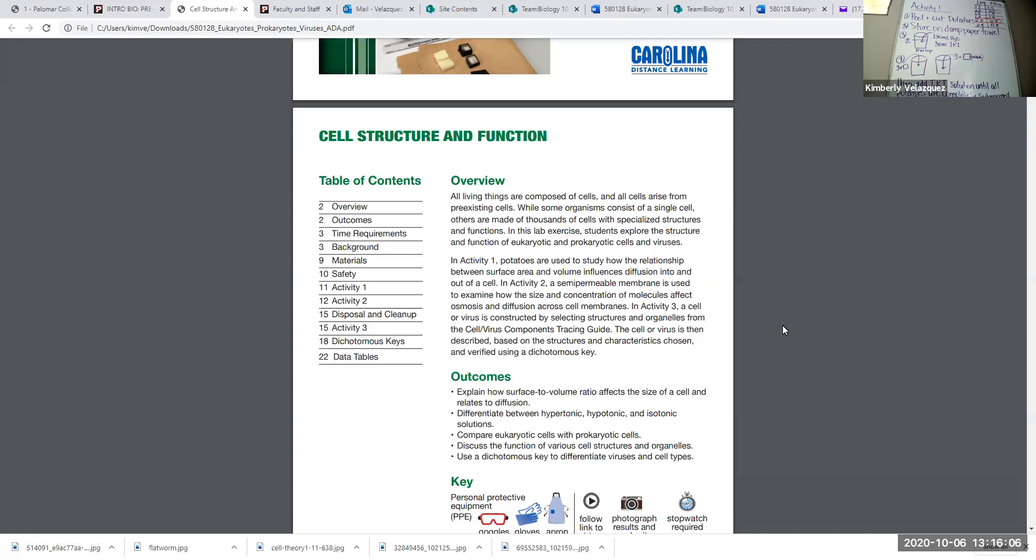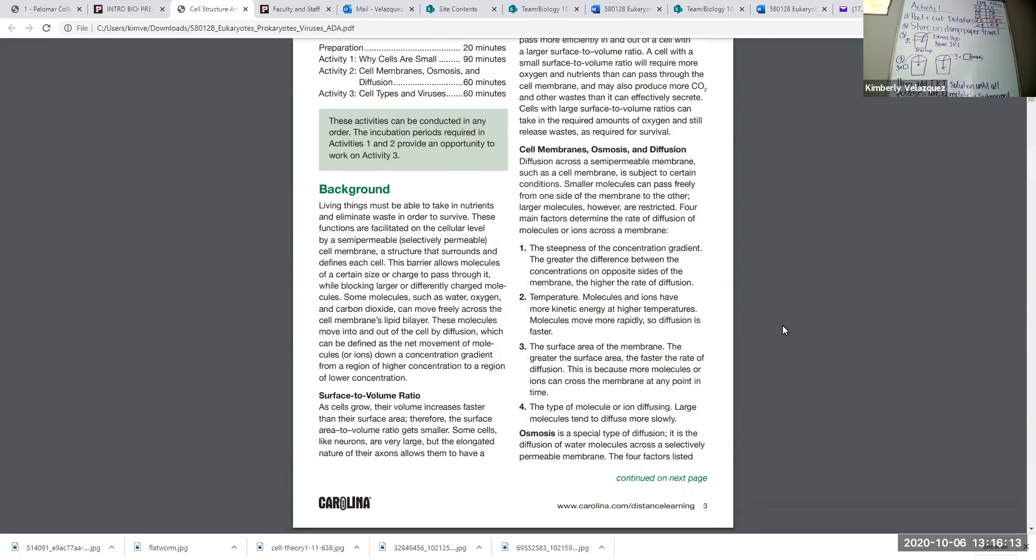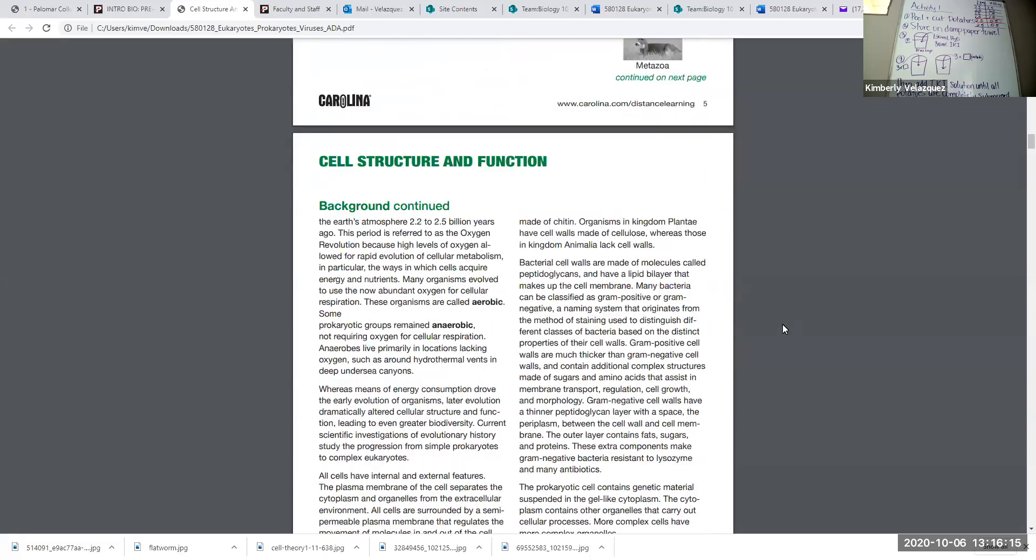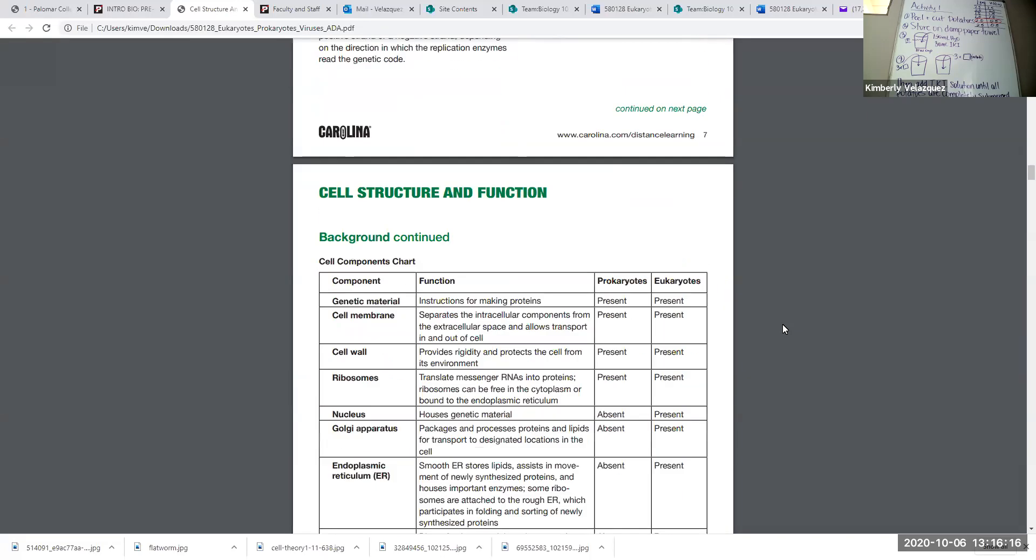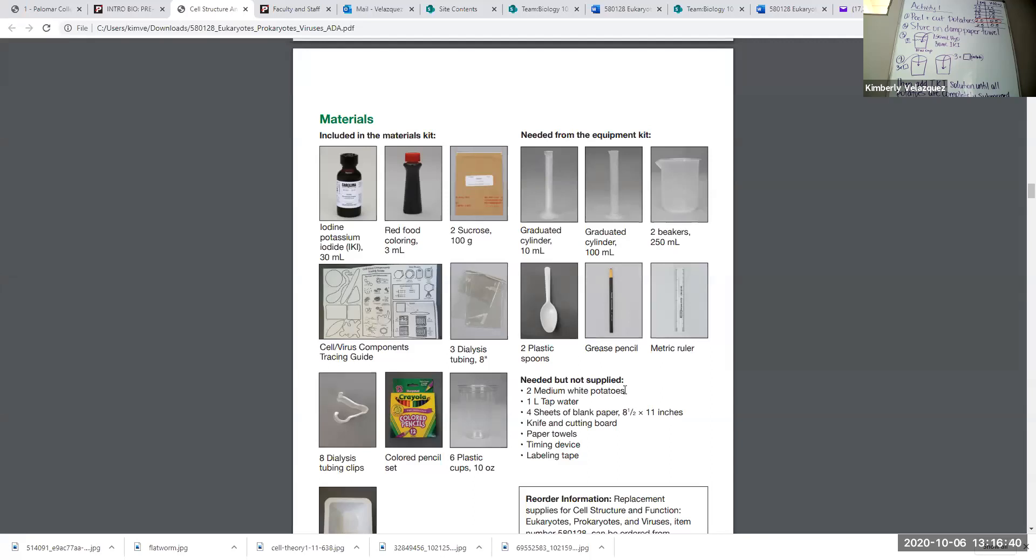We are going to demonstrate that today using potatoes. You do need some materials today that are not included in your lab kit. I'm just going to fast forward through all of this background material and go to the materials. Most of these on this list of needed but not supplied are used in today's activity. Pretty much everything except for the blank paper is needed for today. The blank paper is used for activity three. You do need one large or two medium potatoes. They don't have to be white potatoes. They really can be any kind of potato. You need some tap water, a cutting board and knife, and I would say a potato peeler would be great too. These do have to be peeled.